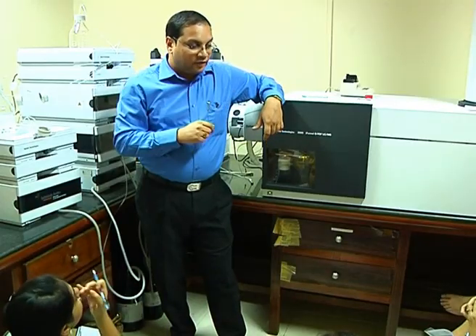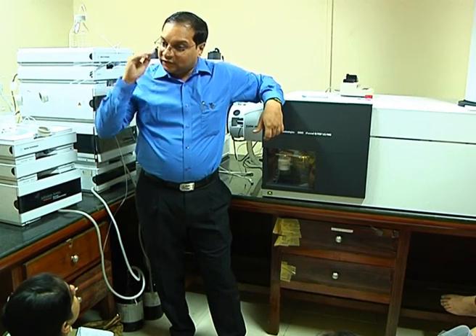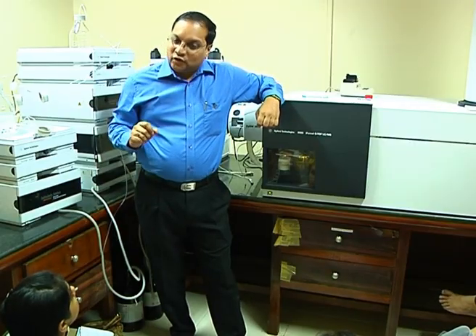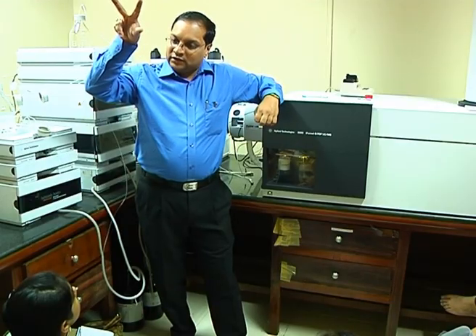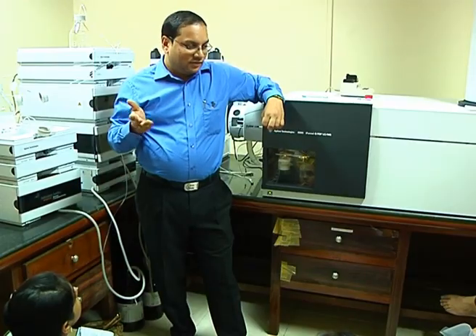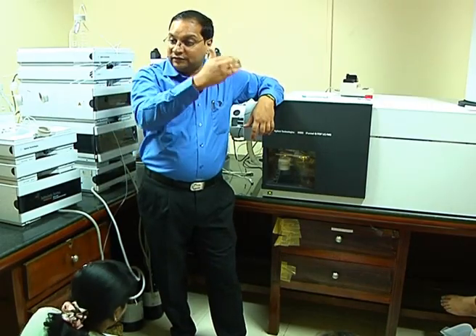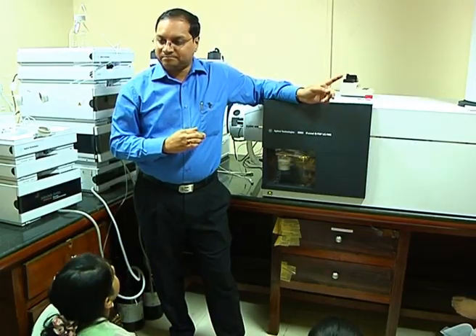But the moment you put time of flight, 500 becomes 500.12345, and the fragment of 500.12345 becomes 10 different fragments of accurate mass. So it is absolutely unlikely that a peptide of a different sequence is giving the same MSMS pattern with the same masses. So the match will be absolutely perfect. You started with nowhere, you ended up somewhere reliable. That's why we need time of flight.